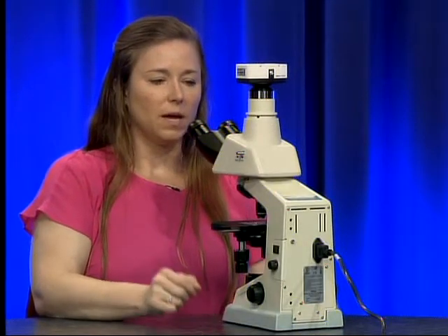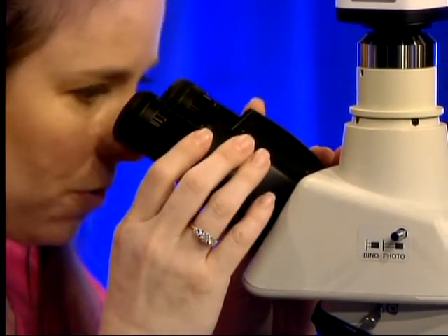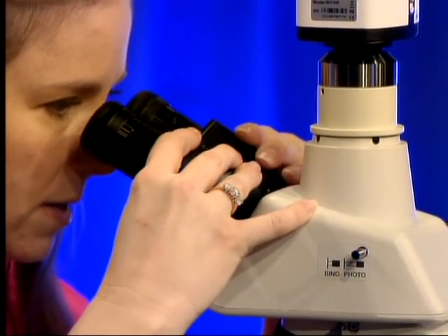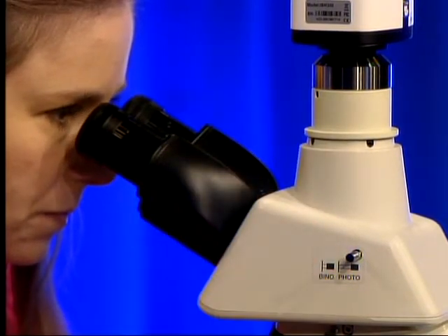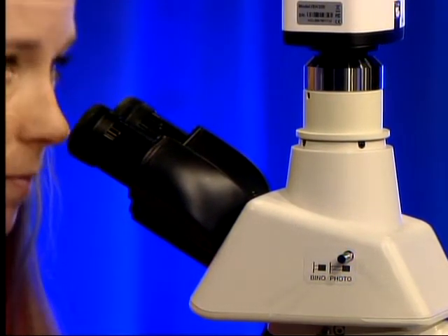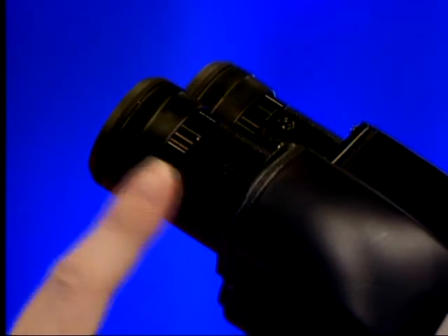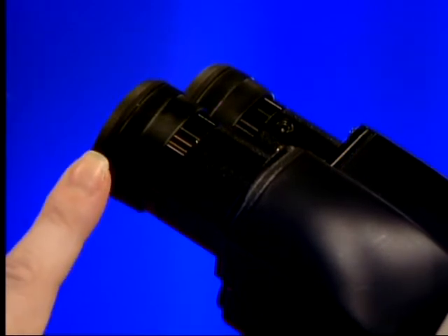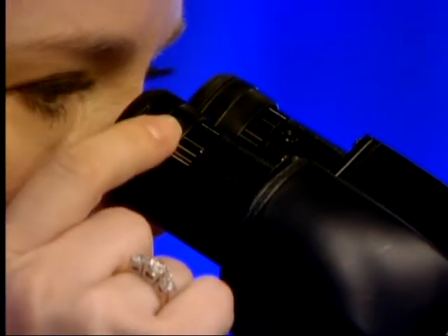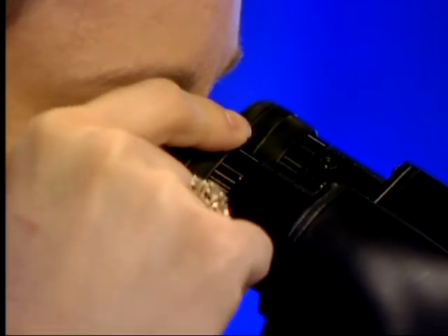A neat feature of this microscope is that the eyepieces will flip upside down, giving you a couple of extra inches of height so you do not have to bend over as far. Adjust the eyepieces just like binoculars to set the distance between your eyes. Also, at the end of each eyepiece is a diopter adjustment, which helps adjust each eyepiece for the difference in focus between your two eyes — for example, if one eye is 20/20 and the other is 20/40. While looking through the eyepiece, slightly adjust the diopter until that eyepiece is the most focused for that eye.